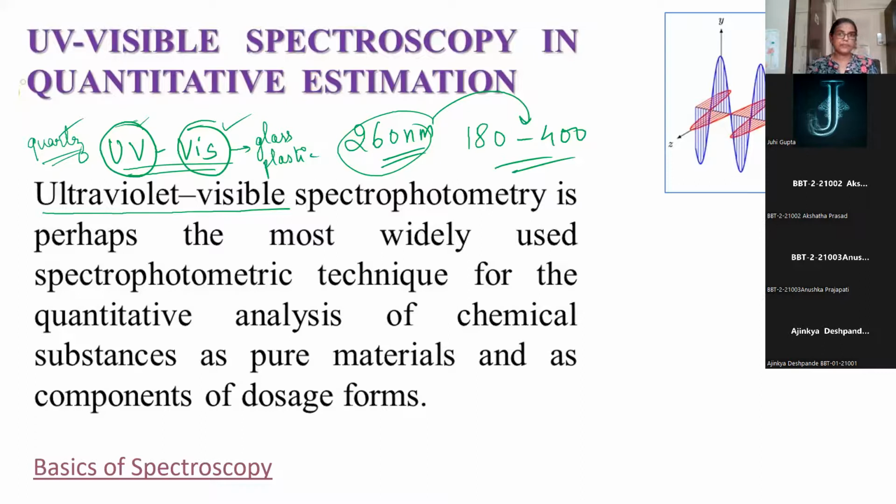Brief introduction to spectroscopy. We know that electromagnetic radiations carry energy in waves. So when these energy-carrying waves strike any material particle, they produce some change in the particle. The study of the effects of interaction between electromagnetic radiation and matter is called spectroscopy.